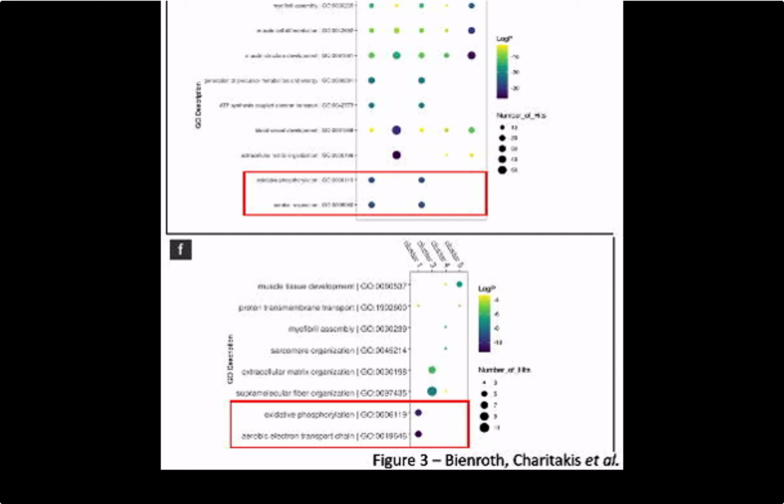Figure 3. Analysis of multi-slice coplanar and single-slice ventricular MCH-TB302 cardiac rhabdomyoma data. Schematic representing location of CRM used for data generation, i.e., ECG displaying location of CRM in left ventricular cavity. Schematic representing approximate locations of sections taken for data generation using the 10x Genomics Visium platform.